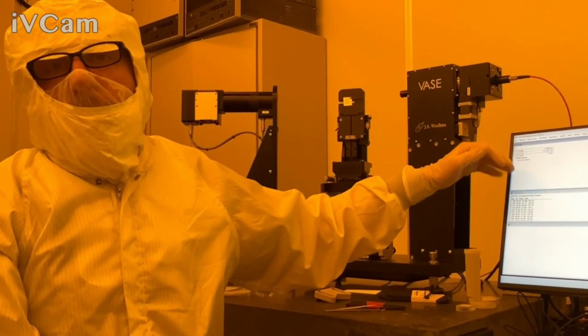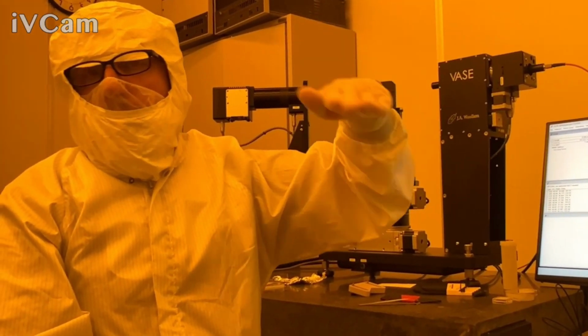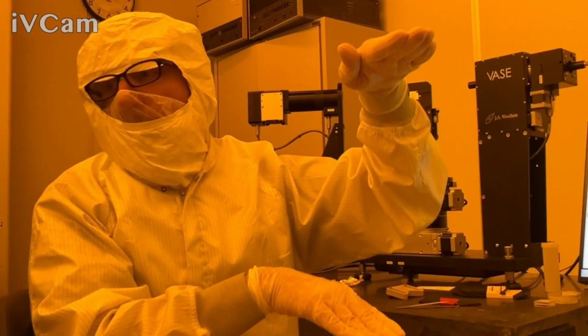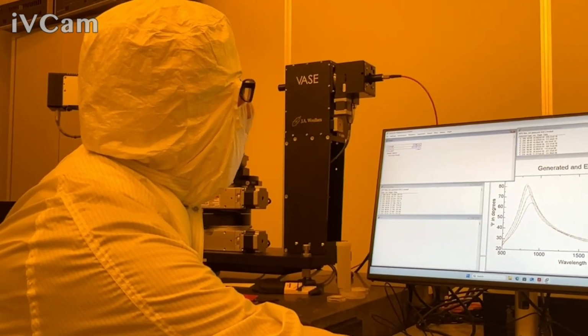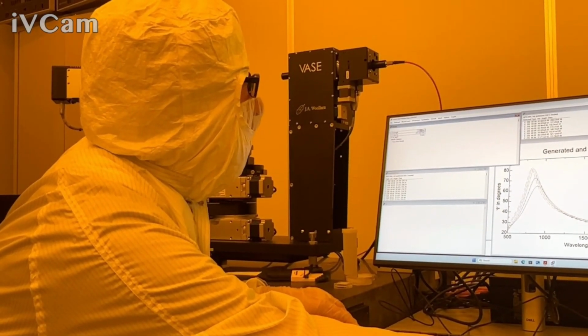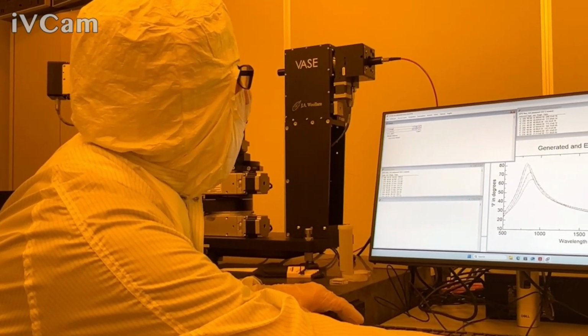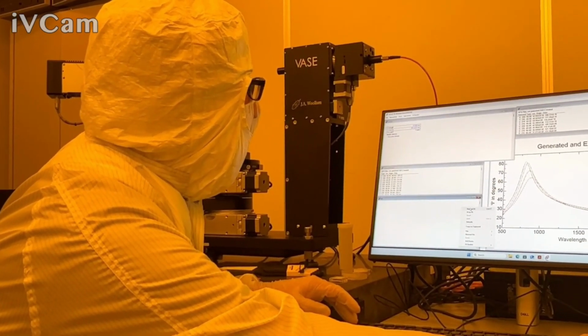If you have that nitride, or amorphous silicon, or something that has a very, very high index, 2, 3 index, that's much further away from the index of 1 than 1.4. So regardless, if you had some roughness here, we start adding it, we'll start to see some shift in the data. Okay. So we're going to be sensitive to fitting it. We didn't try to fit it in this case. I can try to see if that helps my fit.